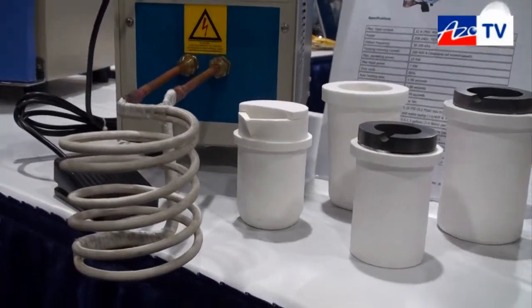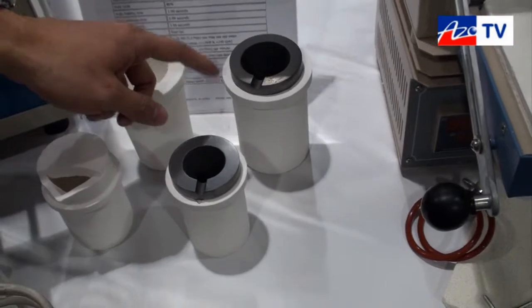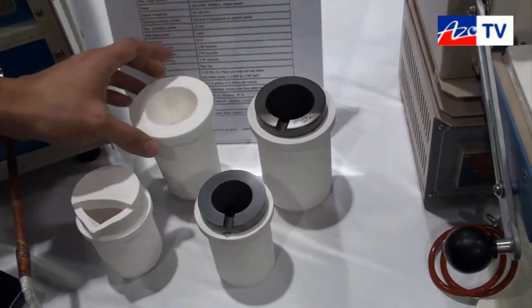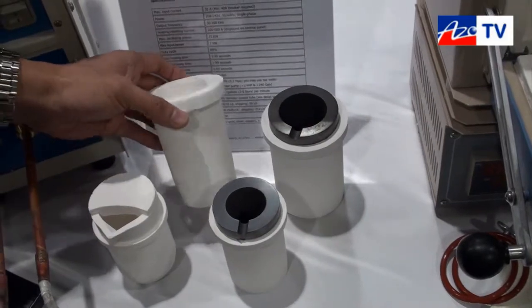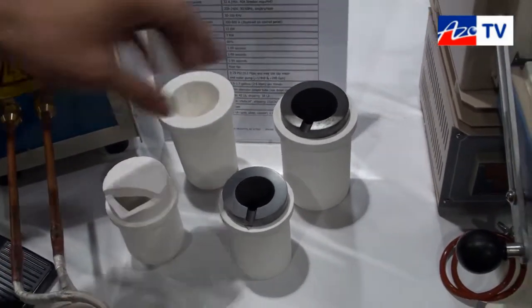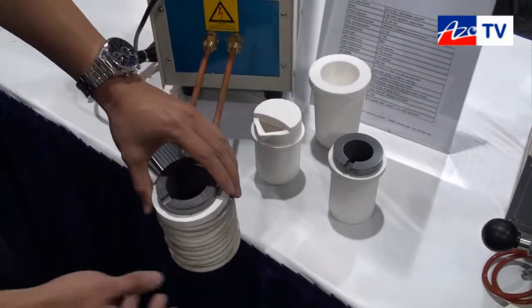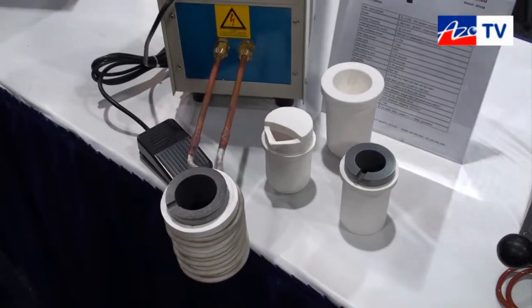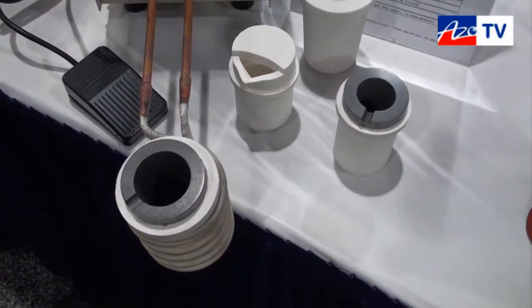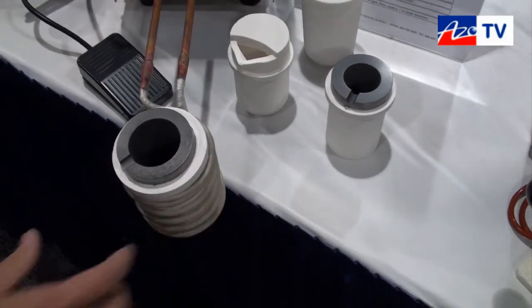For melting, you can use one of our crucibles. This is a graphite crucible with an alumina jacket, and this is silicon dioxide. They are good for melting precious metals. You put it inside the coil and start putting your material inside. We also have crucible tongs that you can use to take it away from the coil when it's done.